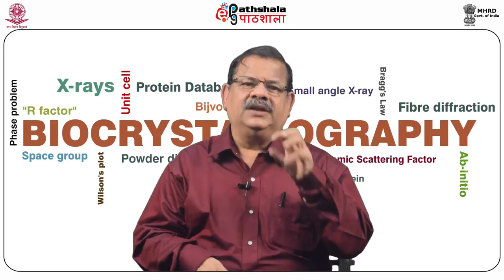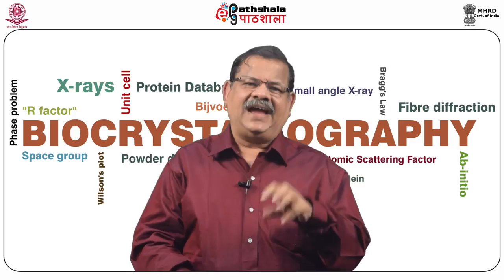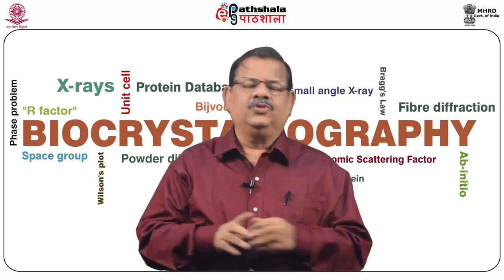We use the tangent formula to obtain individual phases phi HKL from the phase invariants. So the abbreviation tan is used. Together, the first computer program name was given as MULTAN. Multiple solution direct methods is used along with tan, the tangent formula, to give the structural information.